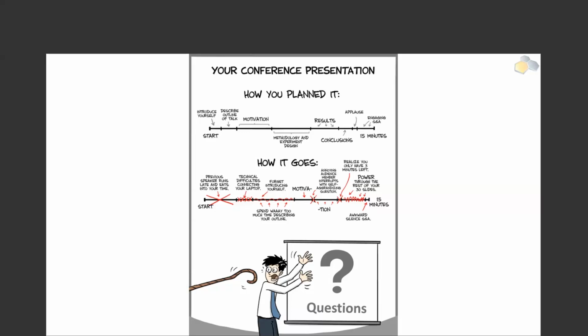So I'm not sure if we could possibly capture DVGs from the reads themselves. We do have some collaborations that we might be able to generate. We might be able to detect these junctions from these reads, but in terms of patient collected samples, we haven't had a chance to work with this kind of data yet.